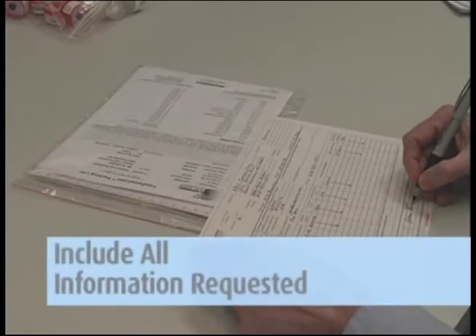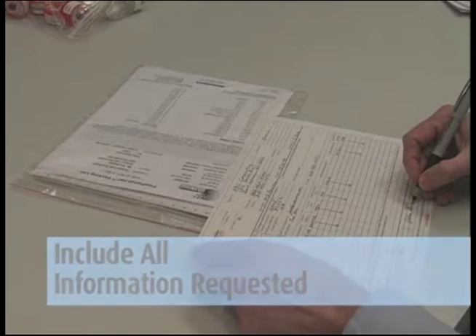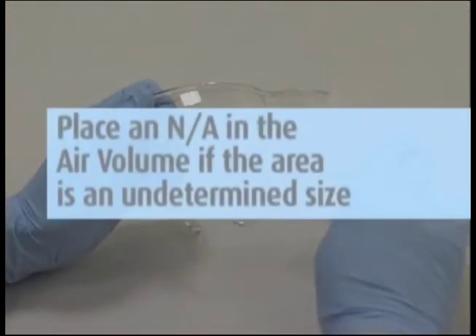Complete the chain of custody form. It is important that you include all the information requested in order to ensure the proper handling and turnaround time of your samples. Place an N.A. in the air volume if the area is an undetermined size and we will report totals. Otherwise, add the area in square centimeters.